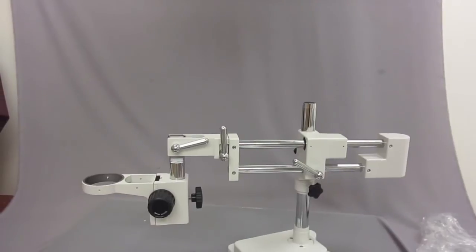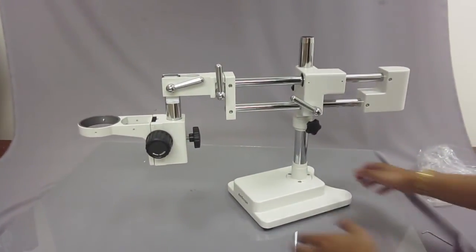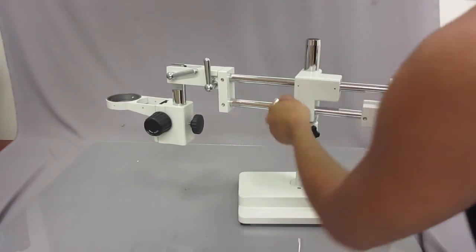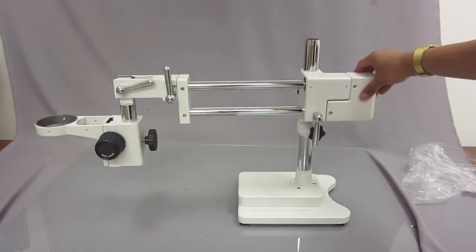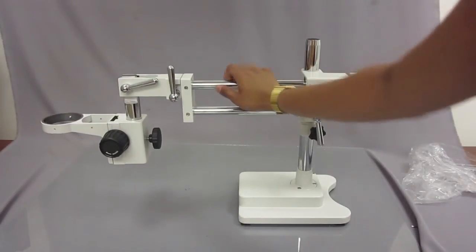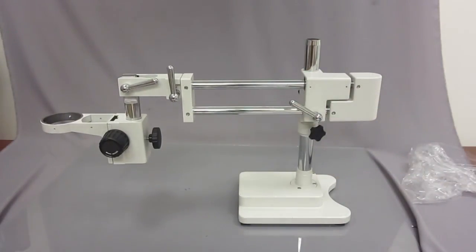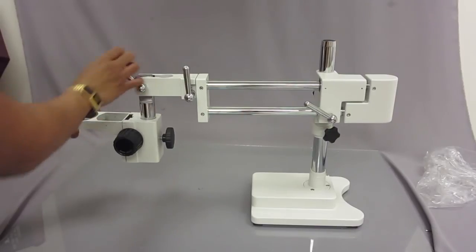The double arm boom stand is meant for a stereo microscope — heavy duty. It easily goes back and forth so you can move it around if you're on a workbench. If you need to look at something at a specific angle, the head of the microscope would be here and you would just unscrew this part.